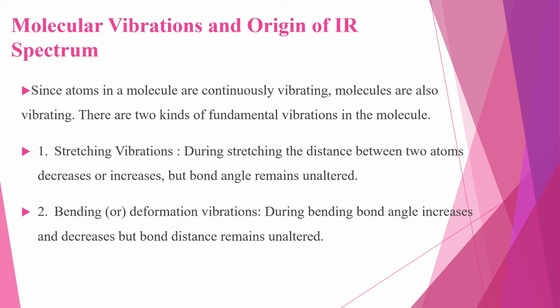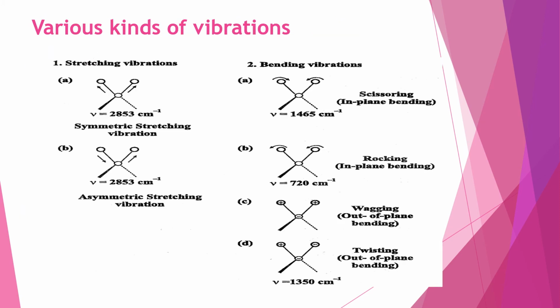We know that more energy is required to stretch a spring than that required to bend it. So we can say that stretching absorption of a bond appears at higher frequencies as compared to the bending absorption of the same bond. Various kinds of vibration.